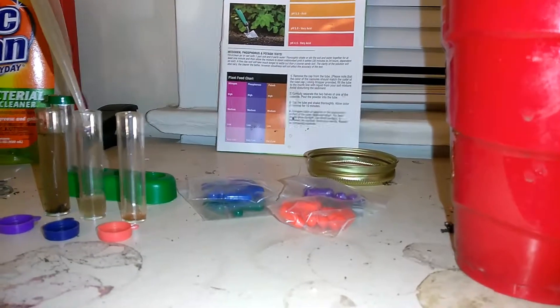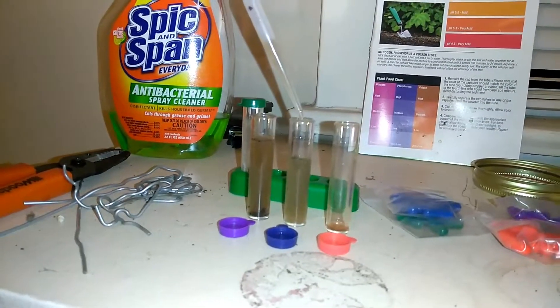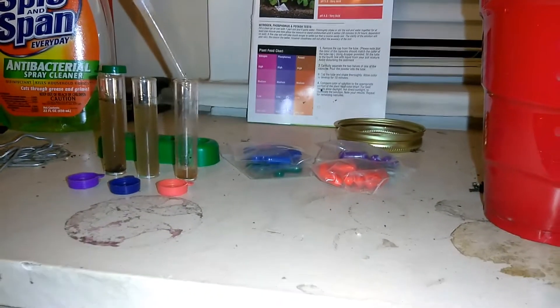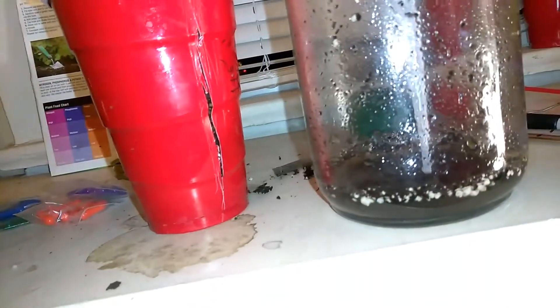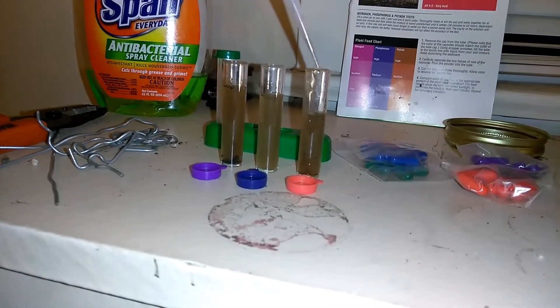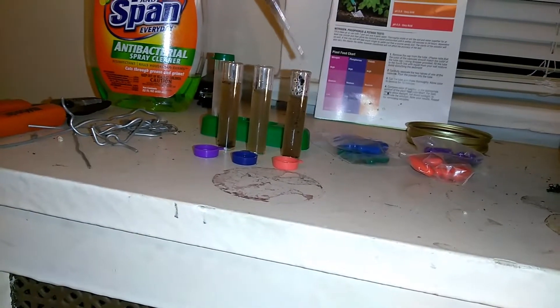Alright, we're going to move on to the next one here. This one is going to be phosphorus. This is relatively a nice setup — you can't really go wrong with this. It's very accurate, it's simple. Just read the instructions, follow and pay attention. It's easy. I don't want this to have a little bit more sediment in it.